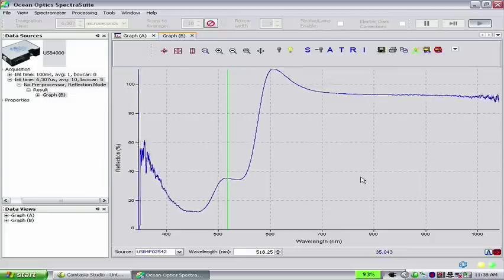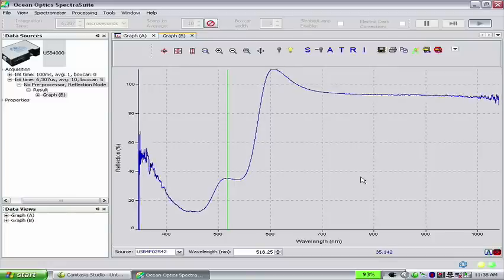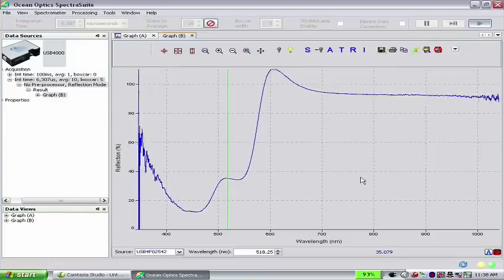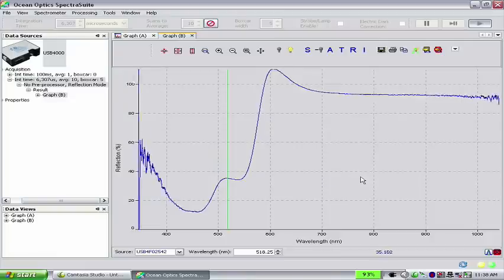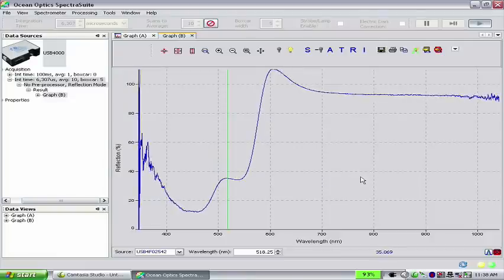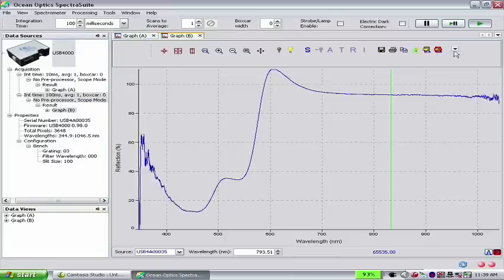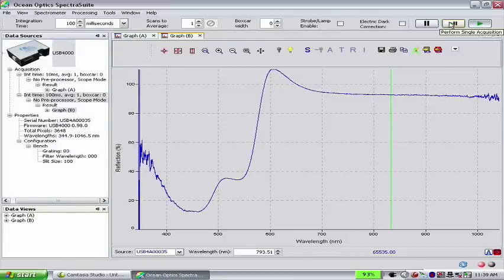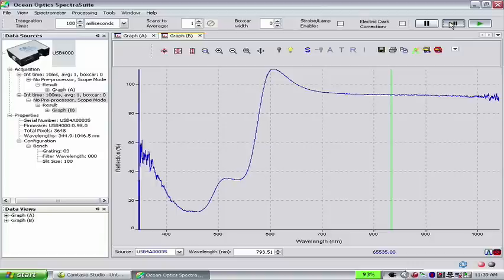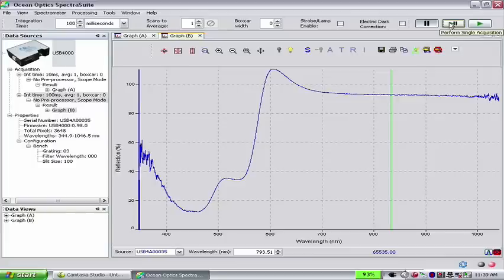Now we'll demonstrate how to set acquisition parameters and store reference and dark spectra without using the wizard. Let's start by clicking the Pause Selected Acquisition button in the Acquisition Controls toolbar. You've seen how the wizard works. Now here's another way to get into absorbance mode in just a few simple steps. Start by clicking on the Graph A tab in the Graph pane.